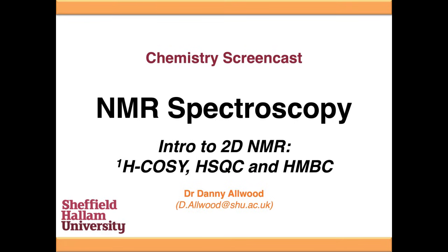So this video is going to introduce two-dimensional NMR, and then we'll see how three of the most commonly used 2D techniques work: proton COSY, HSQC or HMQC, and HMBC.